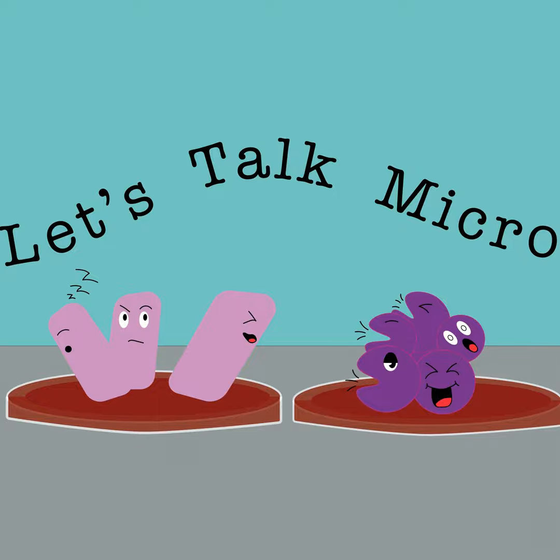And definitely, online learning is convenient for the students, where you can work and not commute, but there are some things like in micro that we do have to get that experience. So you can watch videos all day, but until you start getting your hands on slides and doing things like that, that's when you really tie all those concepts together. So it definitely helps out.